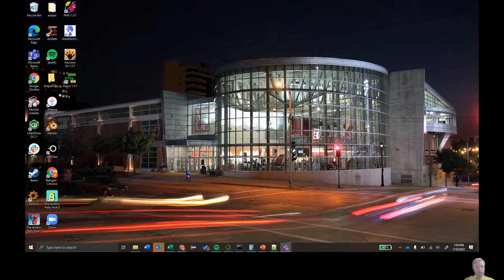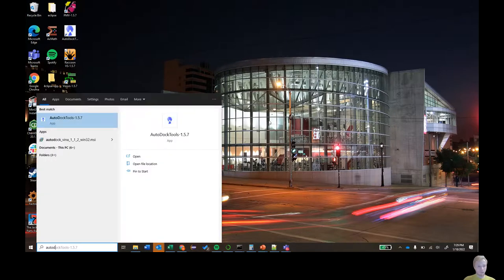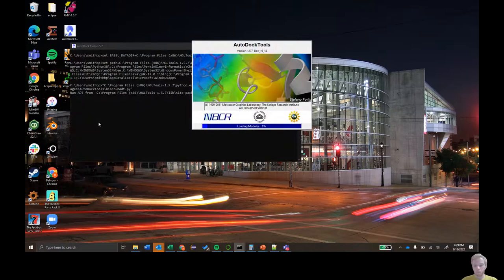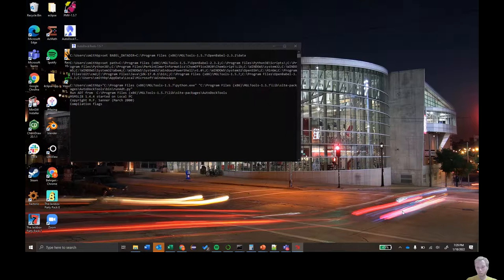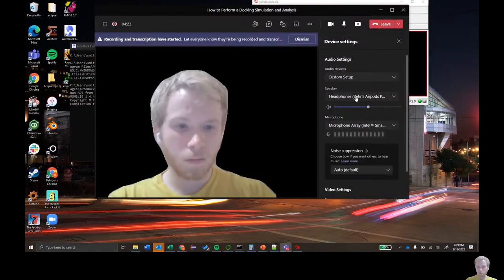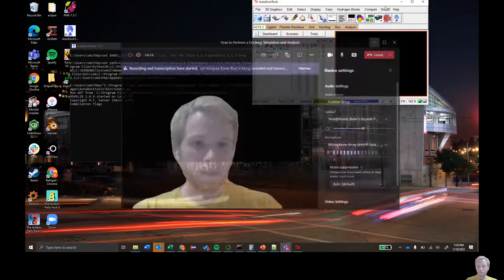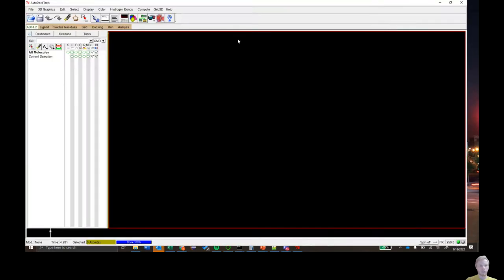Next, we need to launch AutoDock Tools, which you should already have installed. Type 'auto' into your Windows toolbar and this window should pop up. Click on it — it usually takes a second or two to load. Here we have AutoDock Tools launched.